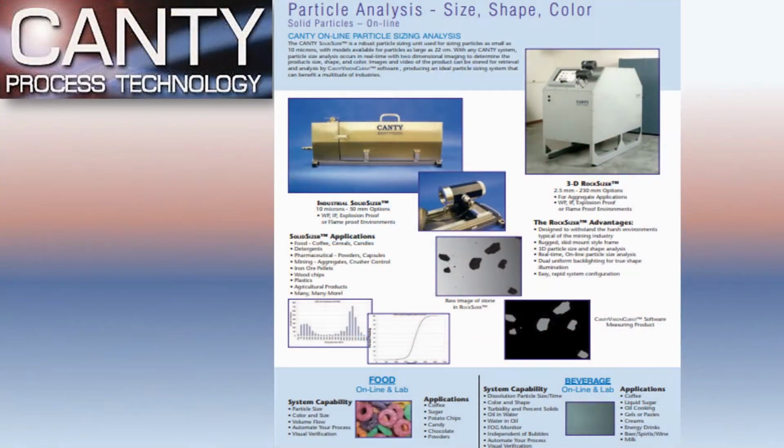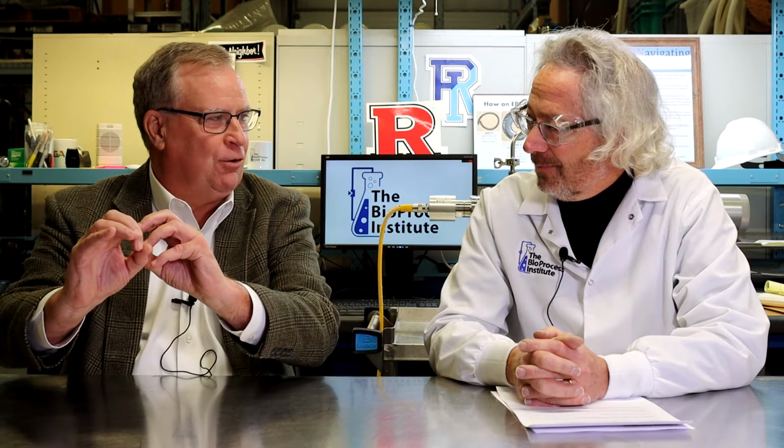And with the particle counting, I think we're in a unique position because imaging technology for particle analysis and counting has been around. We've been doing it for over 30 years. We started off in the sugar industry, actually when they seeded the crystallizers. Oh, wow. Yeah, it was something that we found out in our experience. They were upgrading their sight glasses for safety and complete vacuum, and they were putting a microscope attached to the window to look at the seeding. And I go, that's cool.